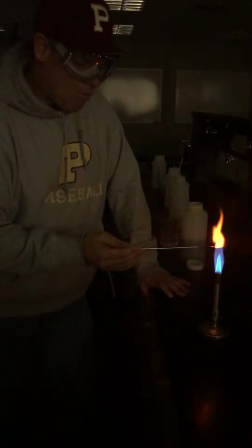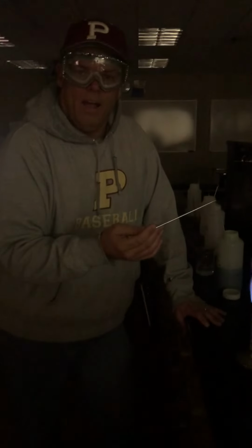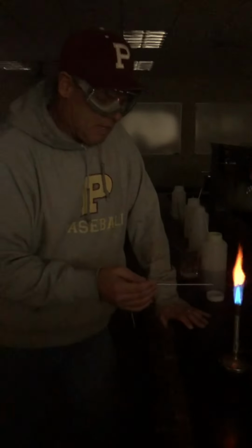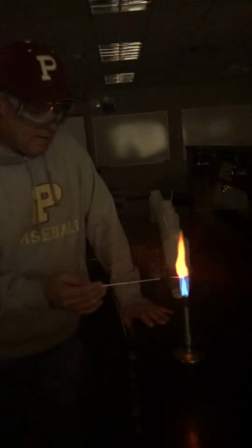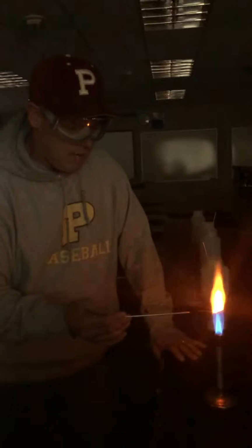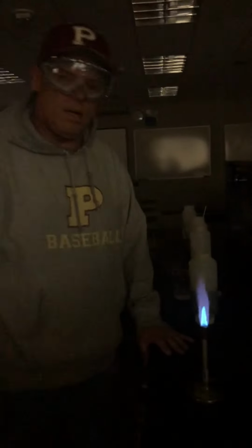So you have to make sure that you understand that, because when we put these solutions in the flame, they're only going to last for a little bit, and then they're going to get burned off, and then you're going to be left with the inoculating loop. So that color that you see there is the color of the inoculating loop, so don't get it confused with other colors.